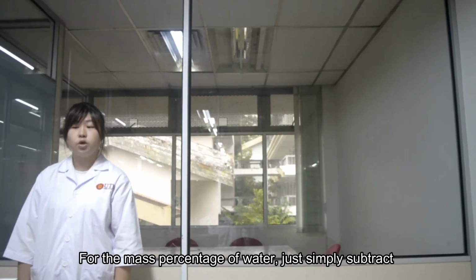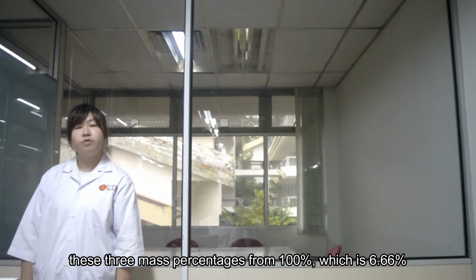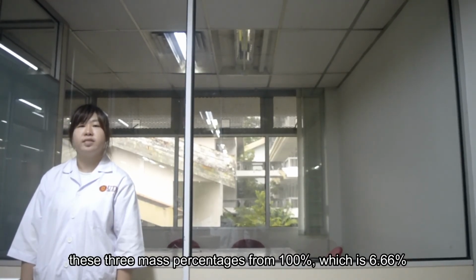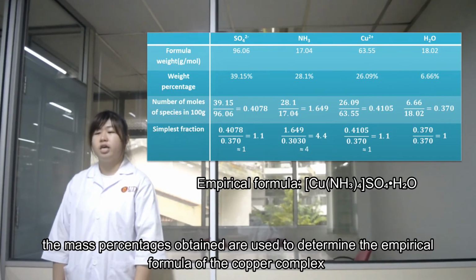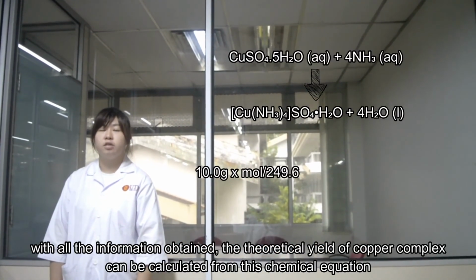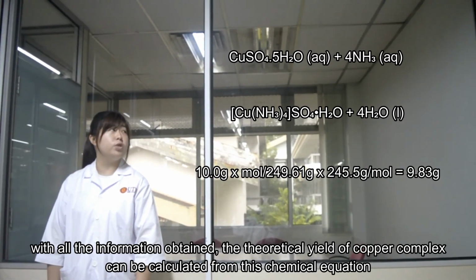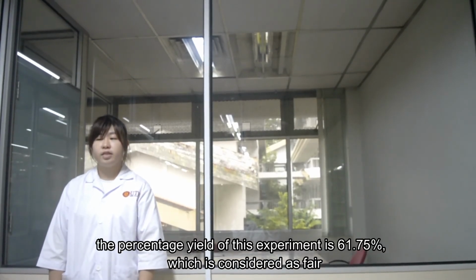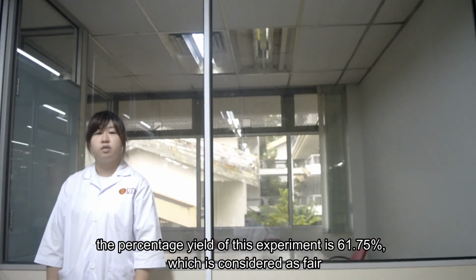For the mass percentage of water, just simply subtract these 3 mass percentages from 100%, which is 6.66%. The mass percentages obtained are used to determine the empirical formula of the copper complex. With all the information obtained, the theoretical yield of the copper complex can be calculated from this chemical equation. The percentage yield of this experiment is 61.75%, which is considered as fair.